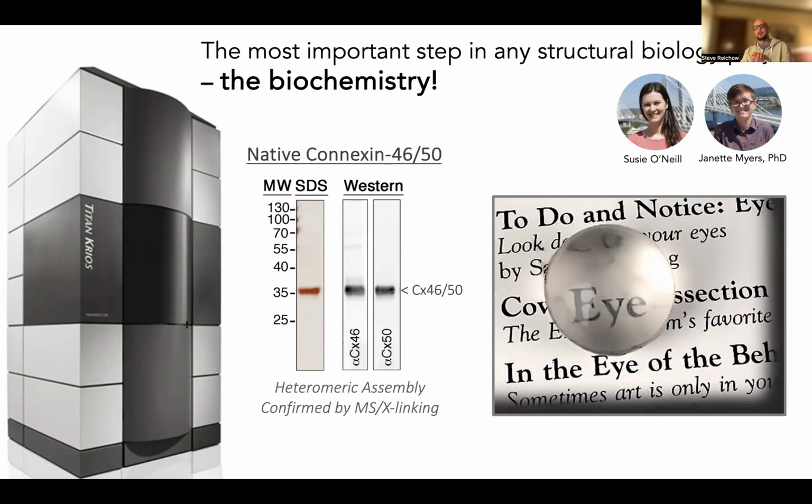But, you know, one of the great things about cryo-EM is once you've worked out your purification, you're ready to start studying it. And all you really have to do is put it onto the electron microscope and start taking pictures and let the data tell you how good your protein is going to behave and if it's going to be suitable for structure determination.